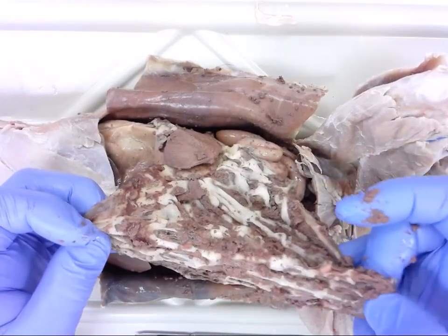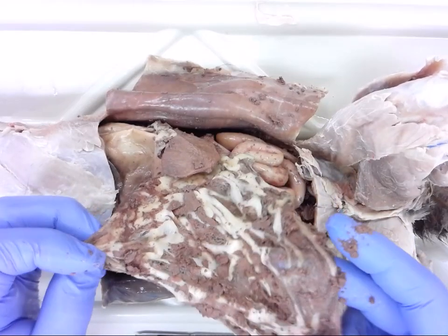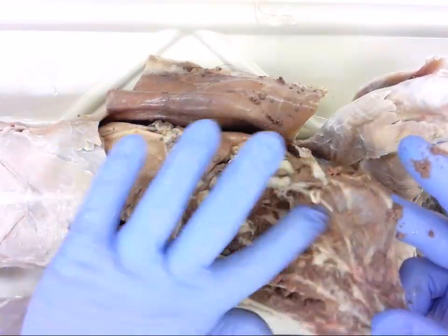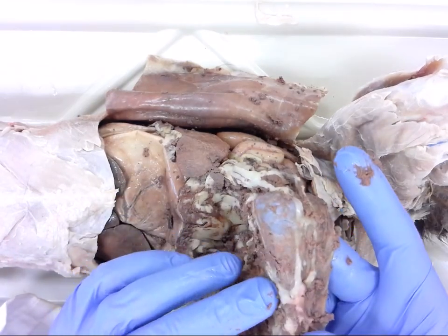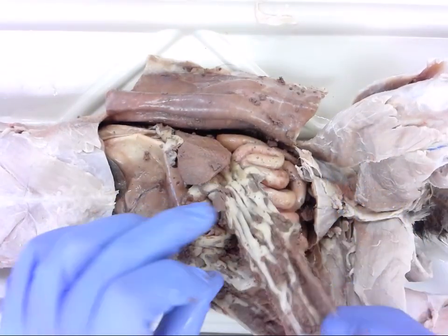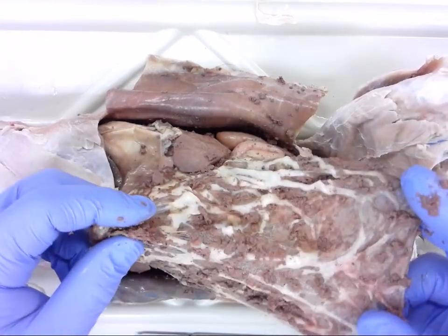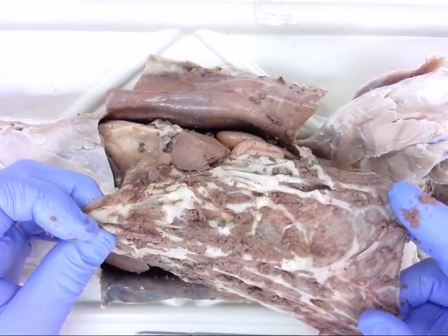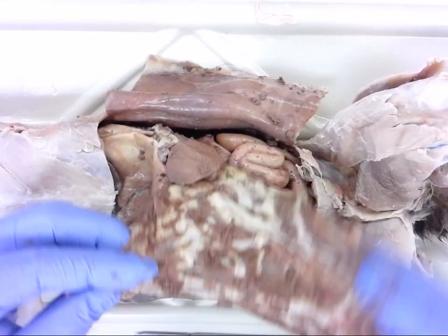Okay, it's a thin membranous material. This one is actually covered quite a bit in blood, but if we were to wipe that away, you can see it's fairly thin and somewhat transparent. You can see through it. But it's also intertwined with a lot of fat deposits. So this is the greater omentum, and it is there to help support abdominal contents as well as fat storage.